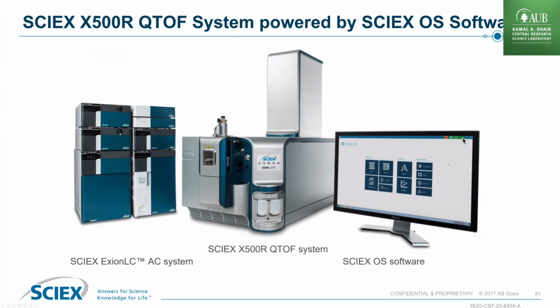So you have here pumps, the autosampler, and the column oven, and then the exit from the column will go through red PEEK tubing up here to the grounding T, up to the source, and then down inside the instrument. The evaporation and the production of ions will happen in this little chamber right here. And then the flow of the ions goes back through the instrument, and then up in the time of flight.